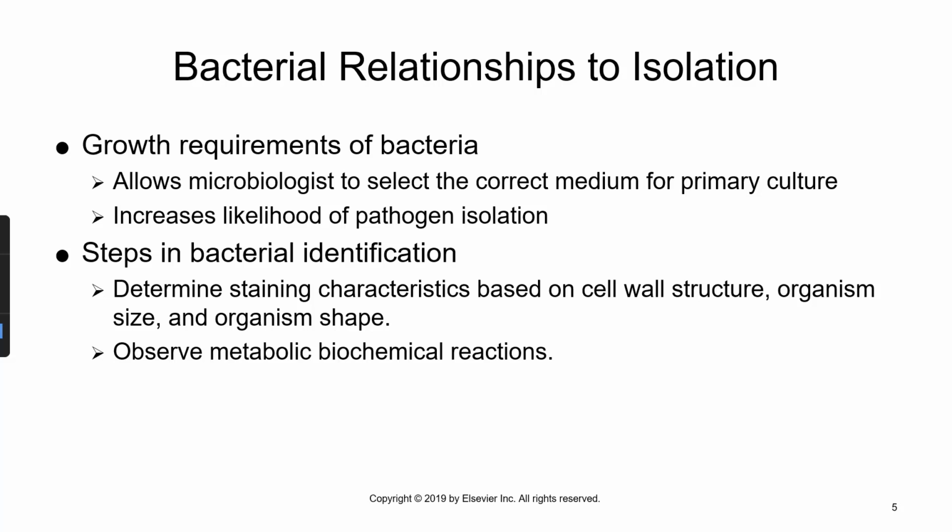Now, all of these steps are the fundamentals of microbiology. Putting bacteria into media, seeing if the bacteria can or cannot eat a certain nutrient, detecting whether it can or cannot eat that nutrient by using color-changing media or pH indicators in the media, and then being able to report out those results.